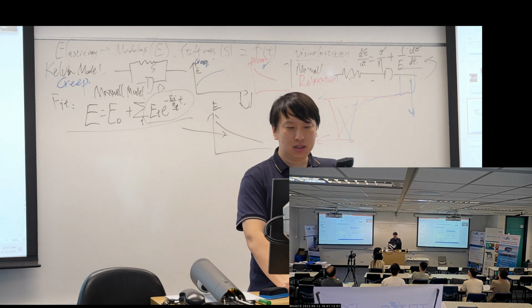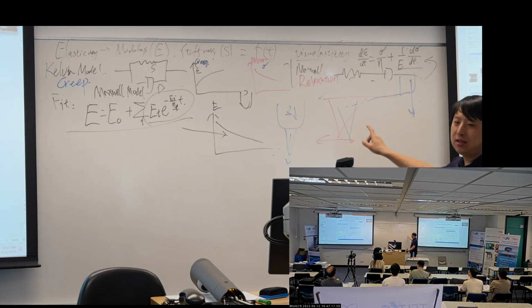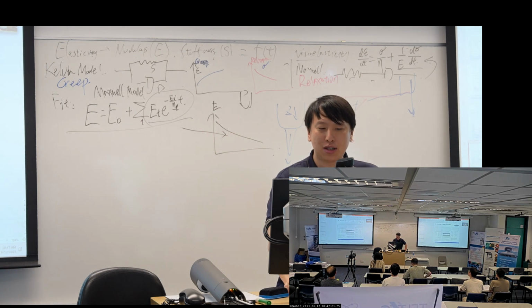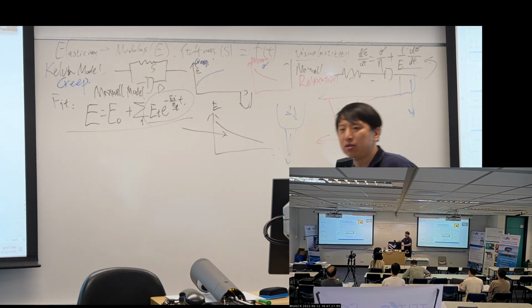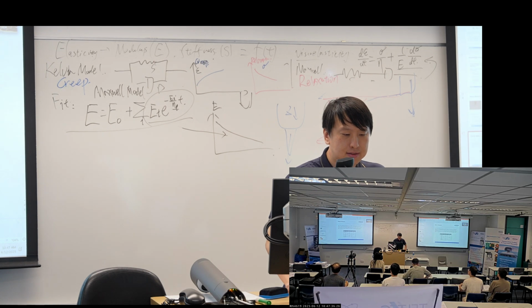So we also introduce how to use this probe. The game is just to do some compensation of this movement. So Bruker needs to ask people to make some changes when they do the force curves. Since it's not widely used, I just skip this part and directly go to our topic today. That's the ramp and hold.